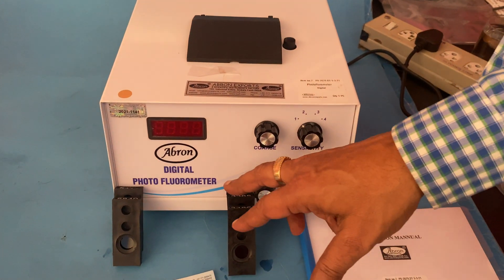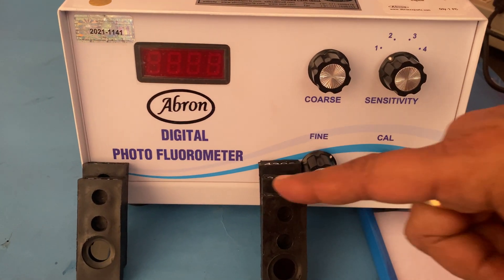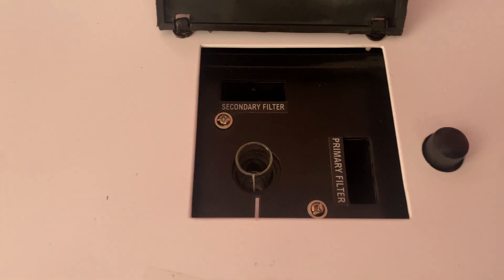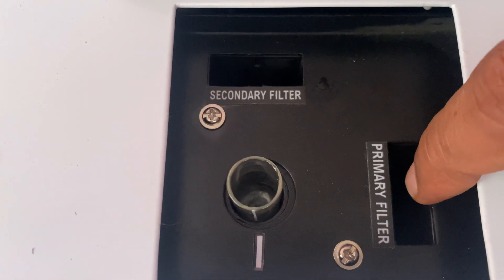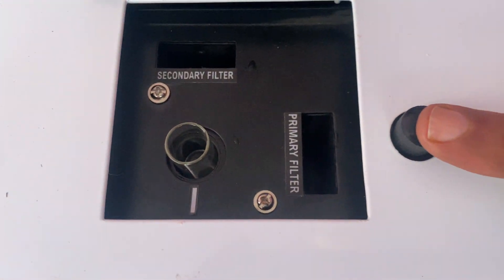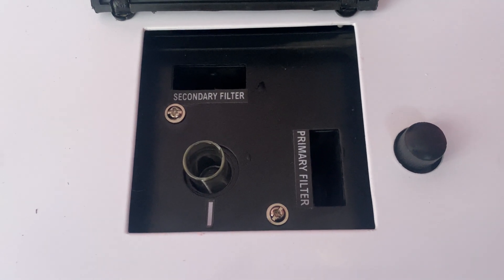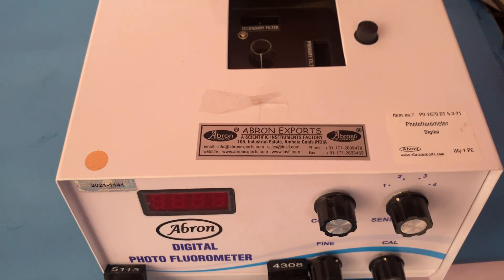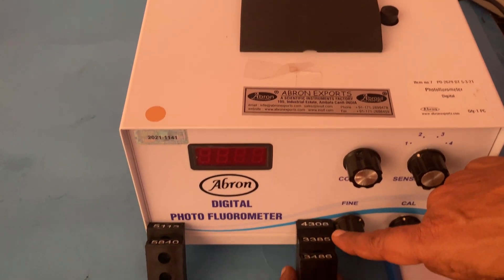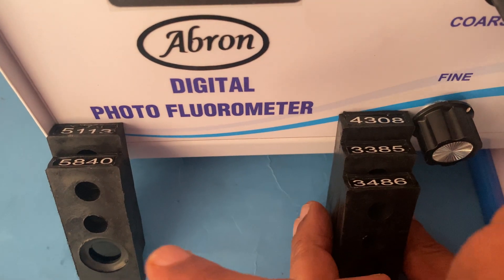This is a digital fluorometer which has two systems. Here we have a chamber which has a secondary filter slot and a primary filter slot. Here we place the sample, and this part is for putting a shutter. On the backside, there are primary filters.